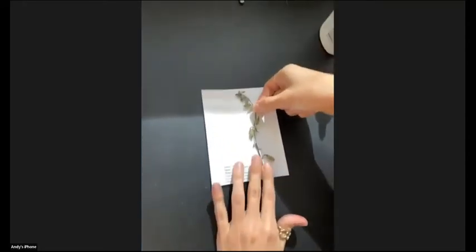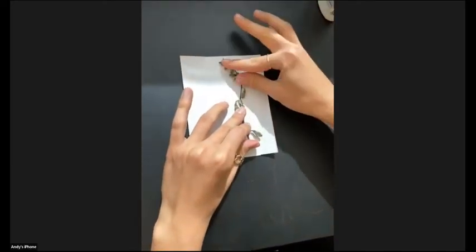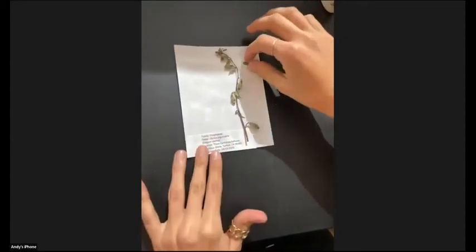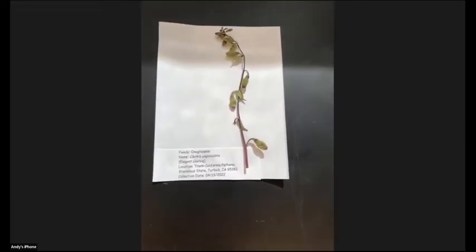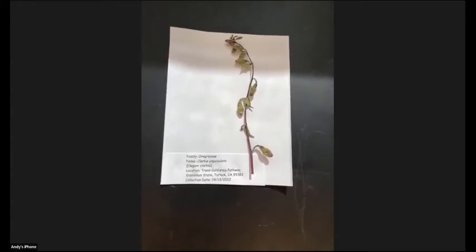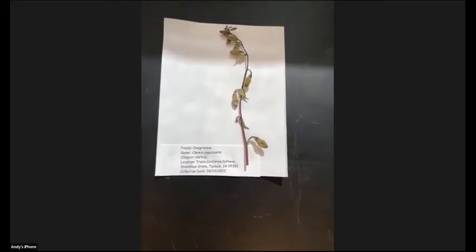Gonna go ahead and place it and then add a little bit of pressure so that the glue can stick. And there we go. Awesome. Thanks, Laura. So with these specimens, if you want to put a little bit of weight on them to hold it down while it's drying, you could certainly put some pencils or markers over them. You just want to make sure that you don't accidentally glue your pencil to your specimen.